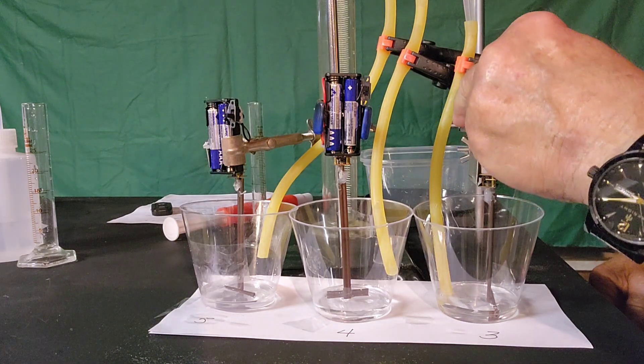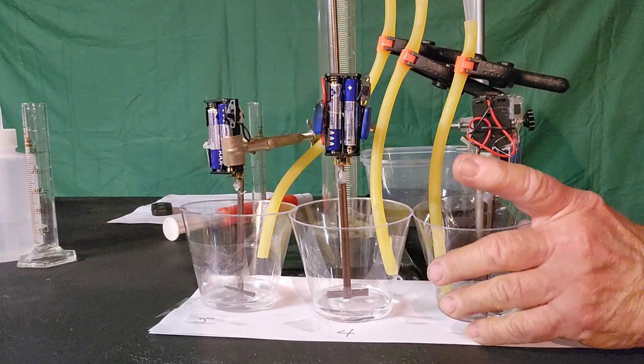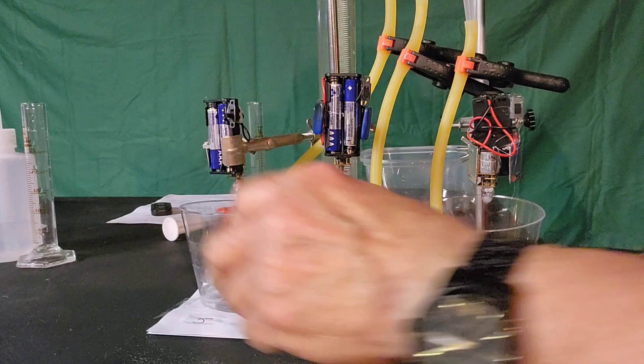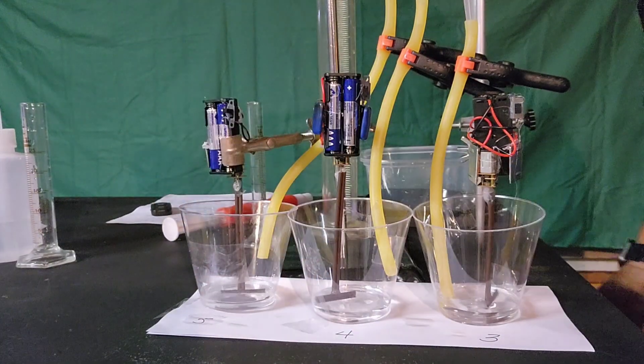Excuse the obnoxious dog — I can't do anything about him. One stirrer motor going. Two stirrer motors going. Three stirrer motors going.